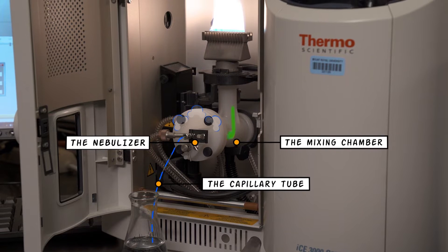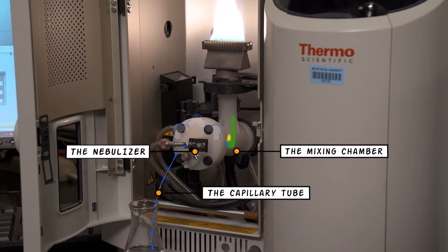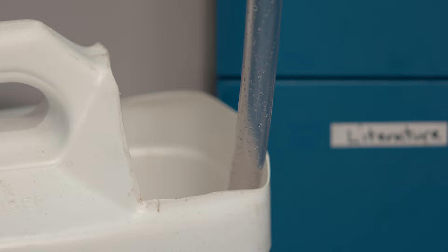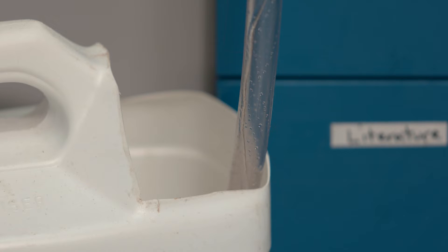The mist then moves into a mixing chamber, where it comes into contact with the fuel, in this case acetylene gas, and compressed air, which contains oxygen. At this point, 90% of the sample will just end up in the waste bucket, and only 10% will be swept into the burner.